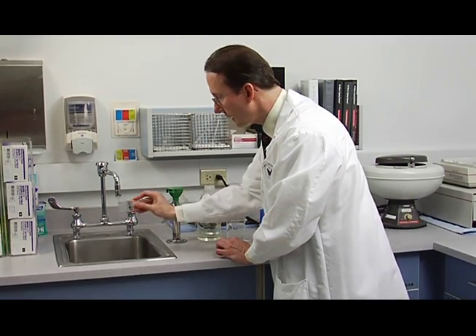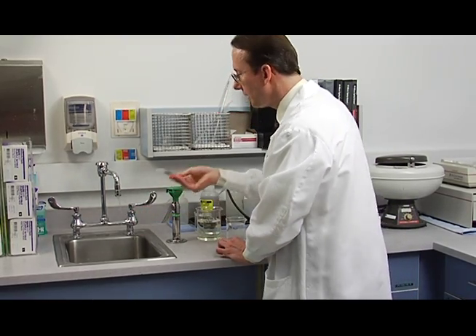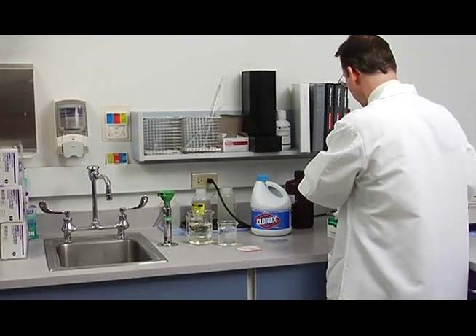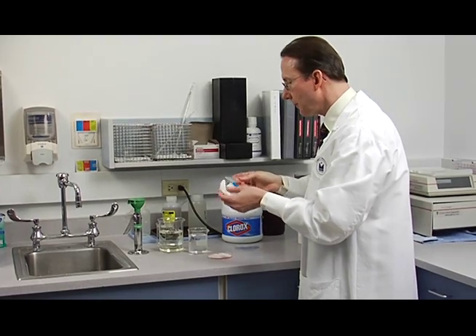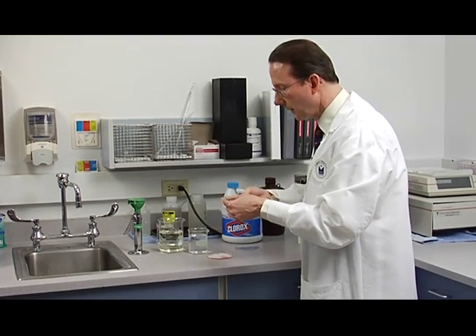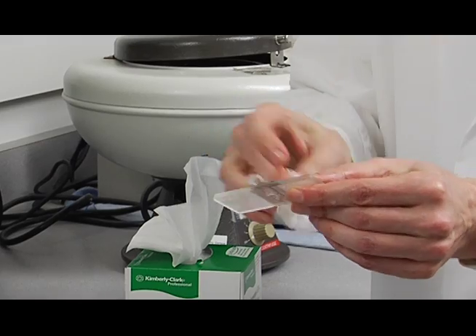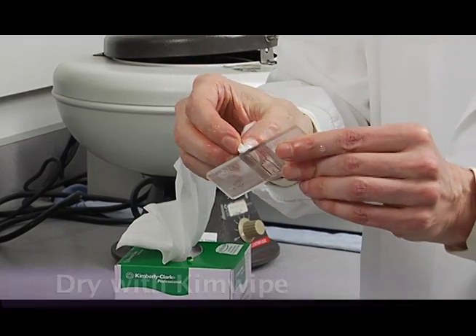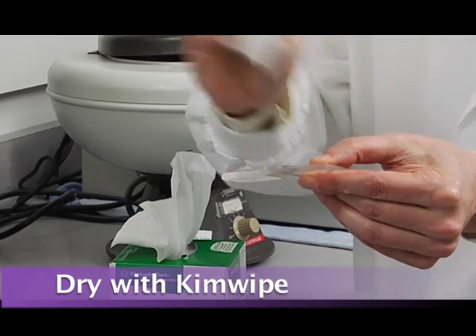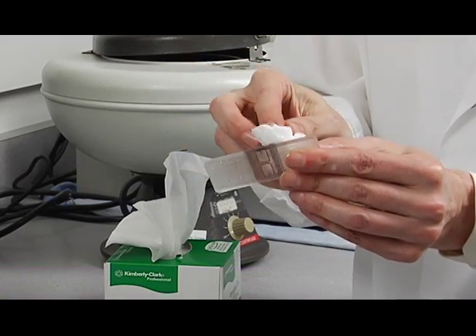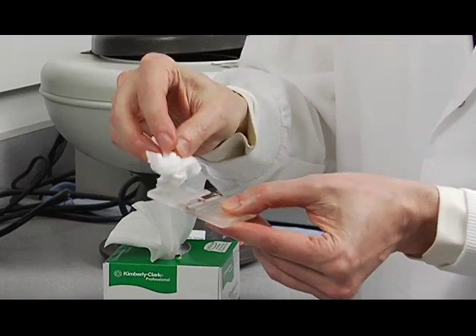Then you shake off the excess water. Make sure you hold it securely so it doesn't drop and break. Then with a lint-free Kimwipe, it needs to be the Kimwipes that do not have kaolin in them so that you don't scratch the hemocytometer. You want to just gently wipe it dry. Don't do this. Just gently wipe it dry.